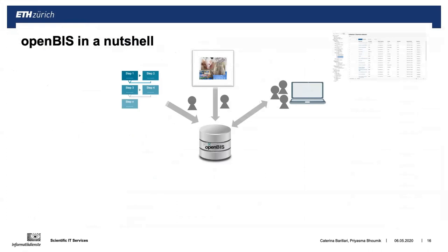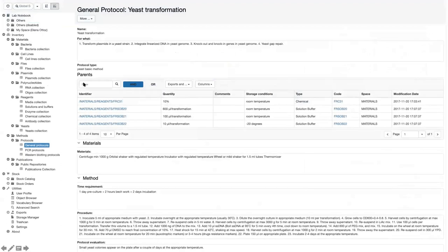OpenBIS can also be used to store protocols — standard procedures of things that you do in the lab. In the inventory there is a method section where protocols can be stored. This is the default for life sciences but can be customized. A protocol might include the name, description, and procedure. What is interesting is the parent section, which provides connections to things stored in the inventory — for example, a connection to a chemical and some buffers. These are the things used in the protocol.